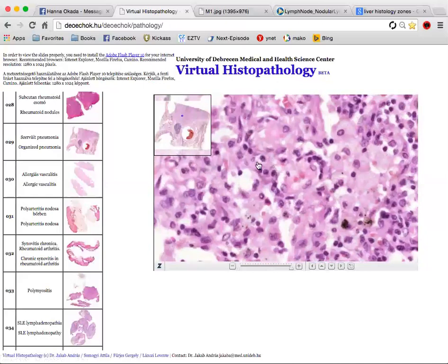But you can see these, this would be the alveolar septa. If you remember, normally the cells would be squamous cells, very flat, because you want to do proper gas exchange, and the flatter they are, the better the gas exchange. But here they look cuboidal. And that's because they are.